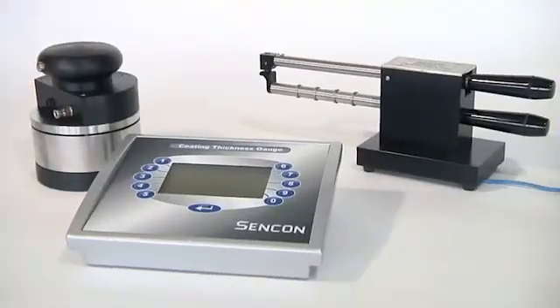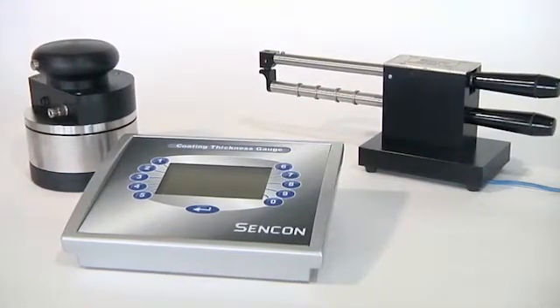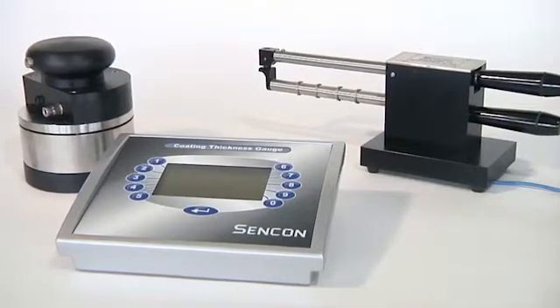Measuring coating thickness is simple, reliable and fast with Sencon's SI9600 gauge.